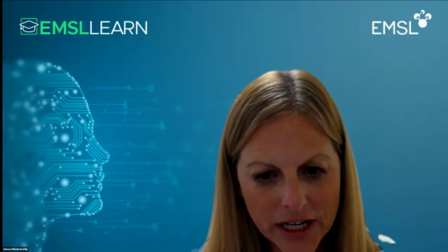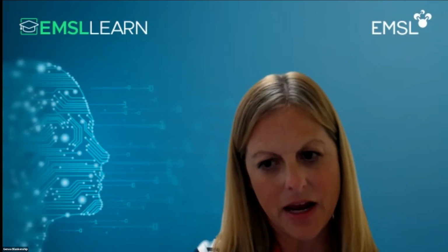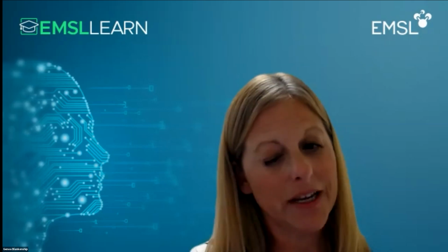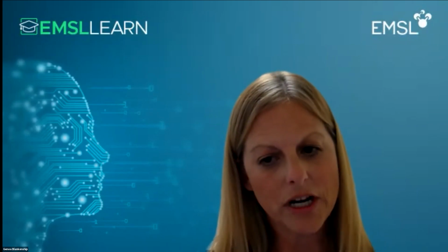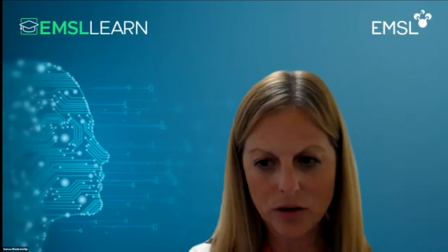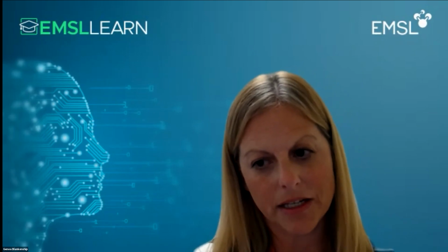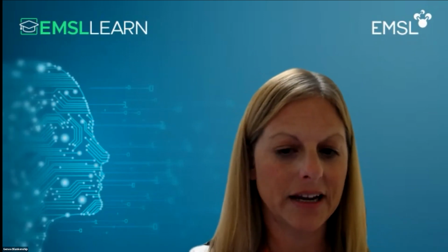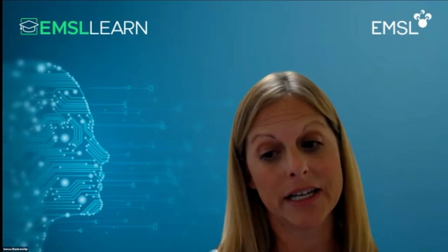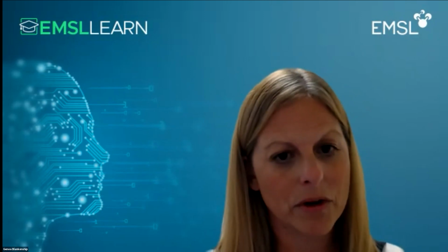Okay, one question from Ravita. What about LCMS metabolomics data? I believe that this is in reference to, at the beginning, when we were talking about which apps support what data type. And this particular person is saying that they have GCMS profiling data and DNA sequencing data. Is there an ability to analyze these data together? So kind of two parts.